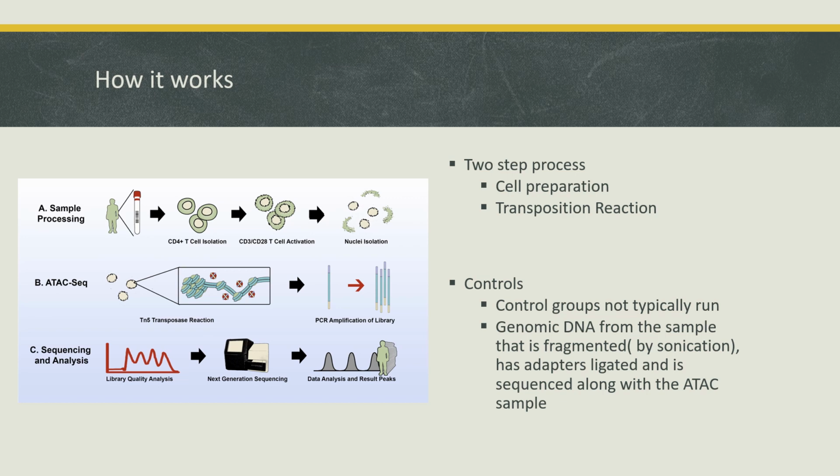For this assay, usually there aren't any controls due to the cost, but if there were, it would likely be genomic DNA from the sample that is fragmented, usually by sonication, has adapters ligated, and is sequenced along with the ATAC sample.